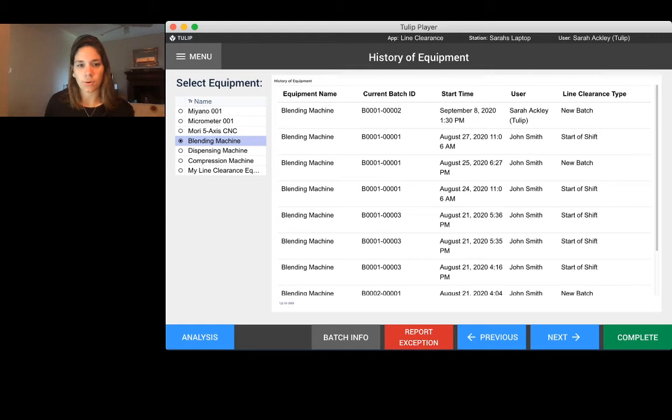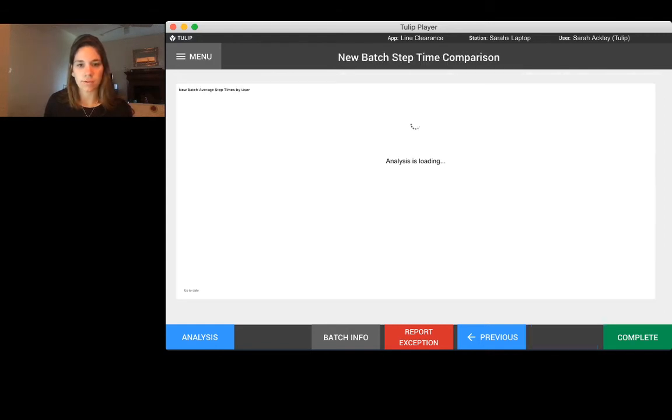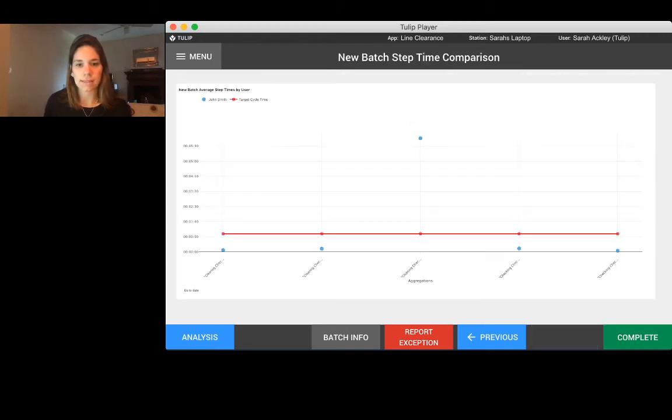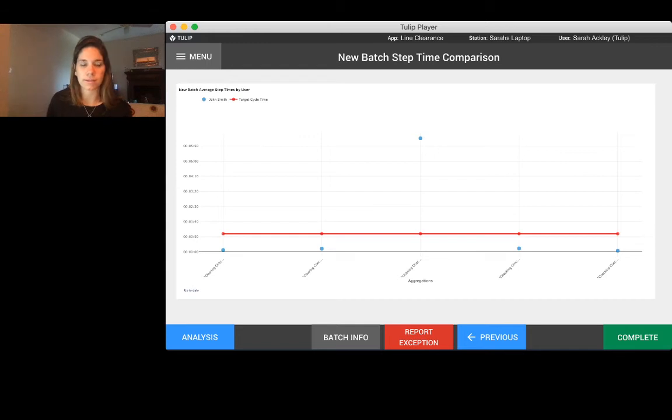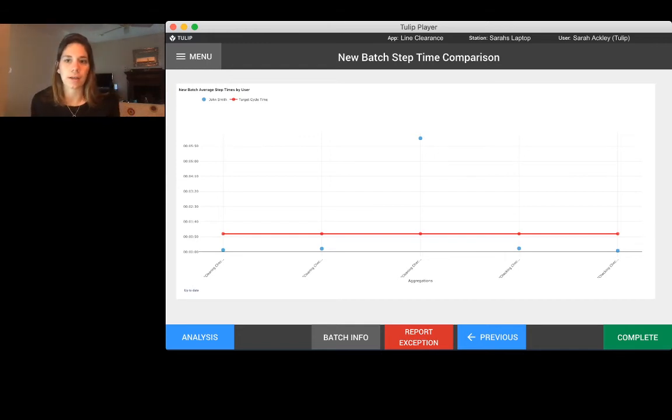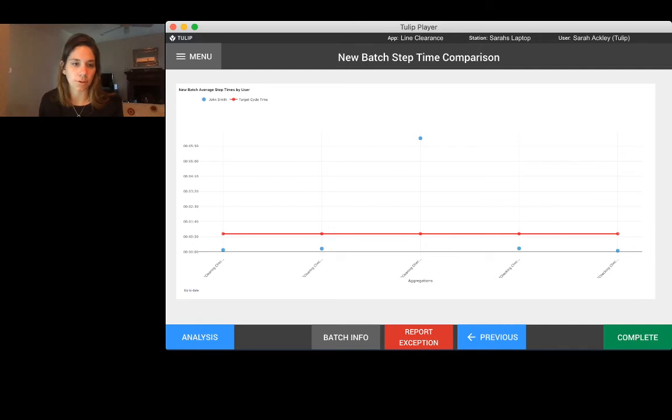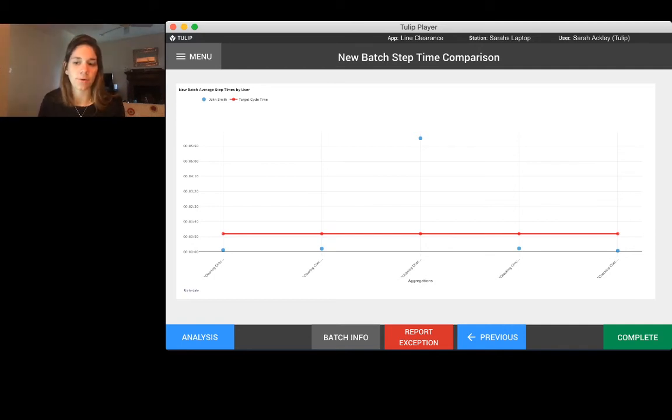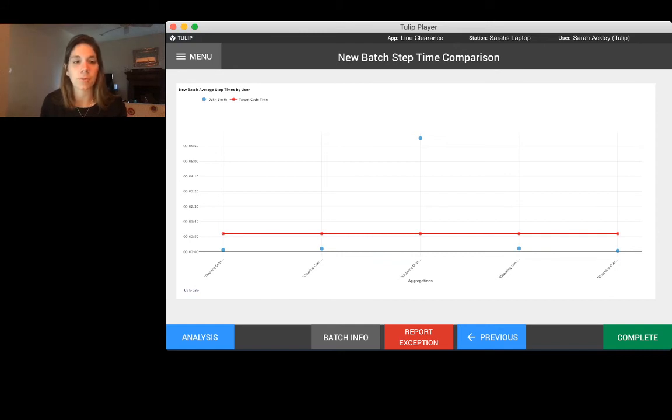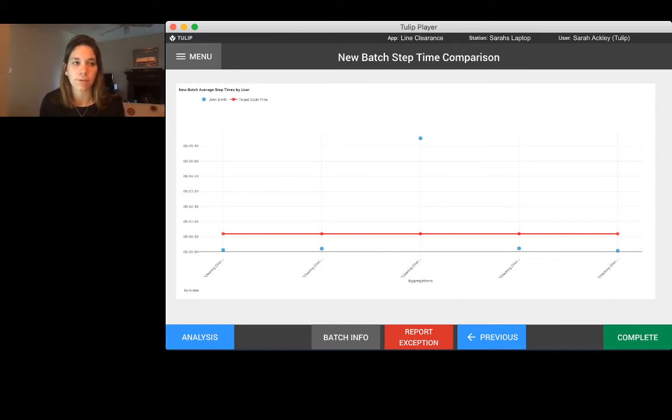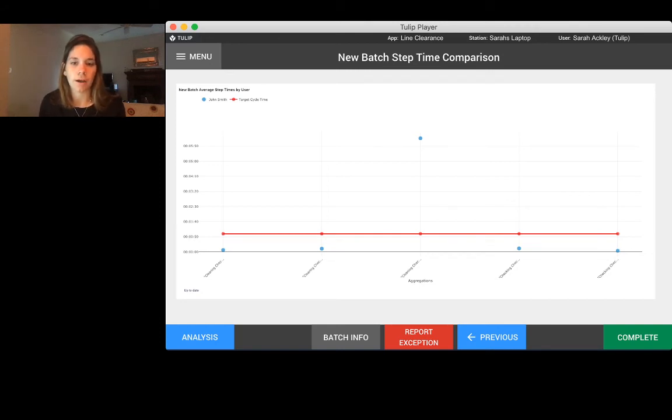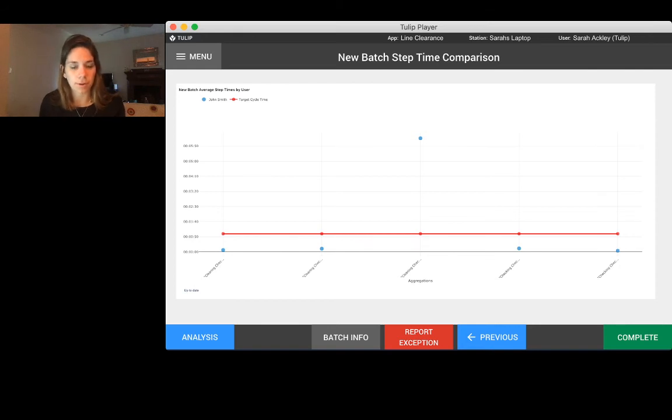That's one of the benefits of using TULIP as your digital record. You get all of your information in digital form. You don't have to store the paper. You also have everything that's legible, which is a big thing. You can build the quality into the design, and then you also have the benefit of having the digital history record and the analytics to be able to optimize your process as well.